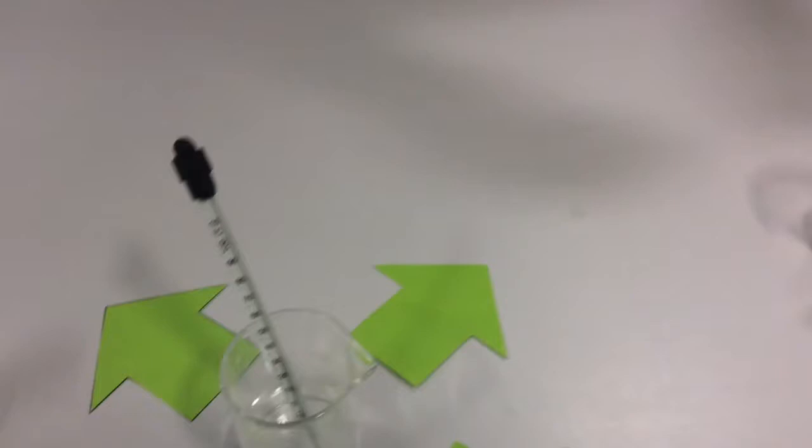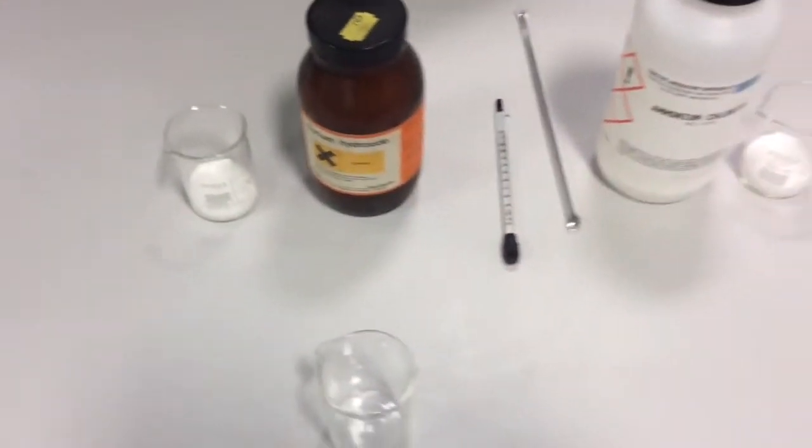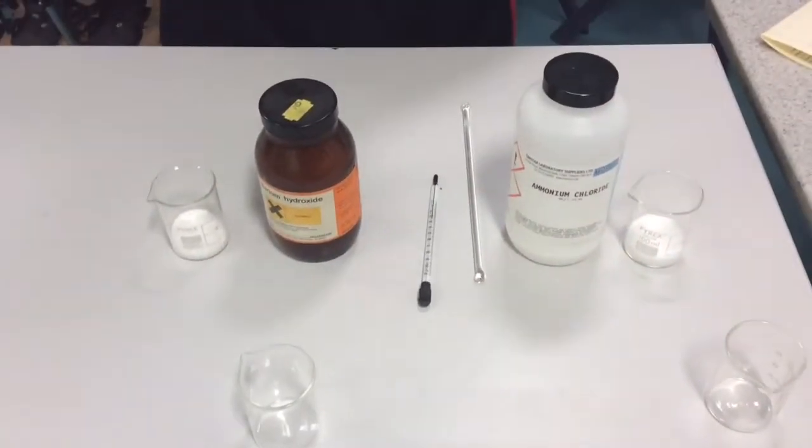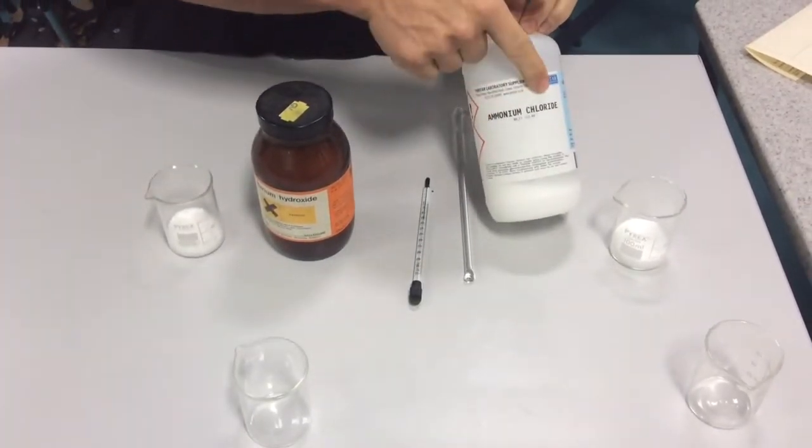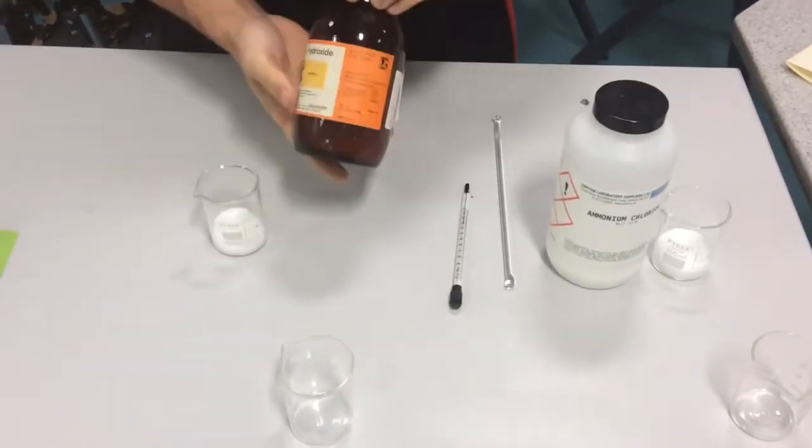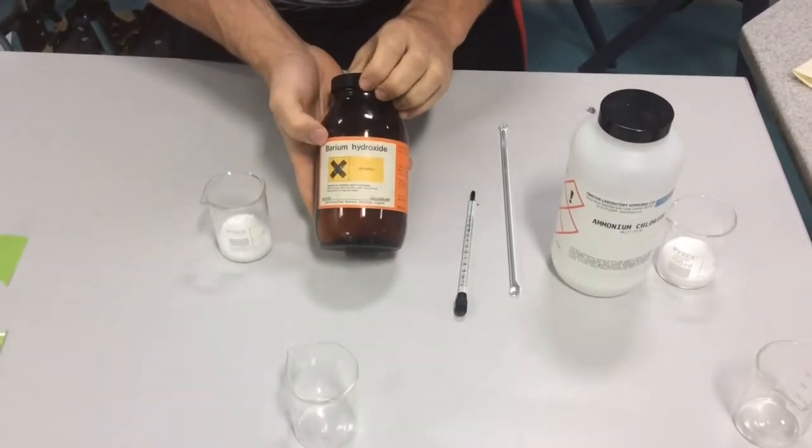Now we're going to look at an endothermic reaction. You're actually going to design an experiment for these two types of chemicals. Here we've got a bit of ammonium chloride, and here we've got a little bit of barium hydroxide.